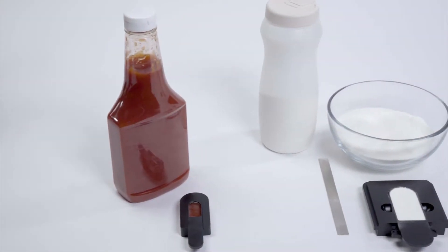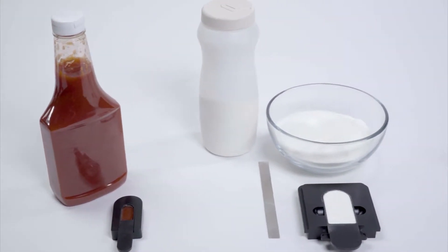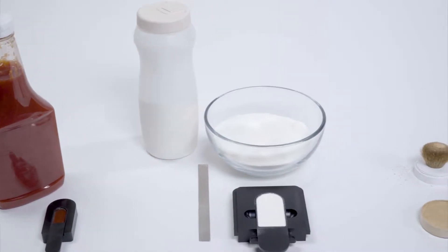The MetaView instrument stand is a helpful accessory if you need to measure liquids, pastes, gels, powders, or odd-shaped items.